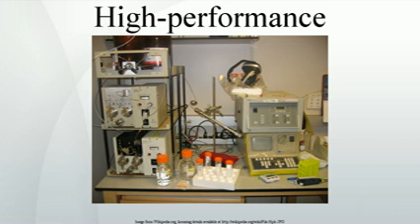Some models of mechanical pumps in a HPLC instrument can mix multiple solvents together in ratios changing in time, generating a composition gradient in the mobile phase. Various detectors are in common use, such as UV-vis, photodiode array, PDA, or based on mass spectrometry. Most HPLC instruments also have a column oven that allows for adjusting the temperature the separation is performed at.